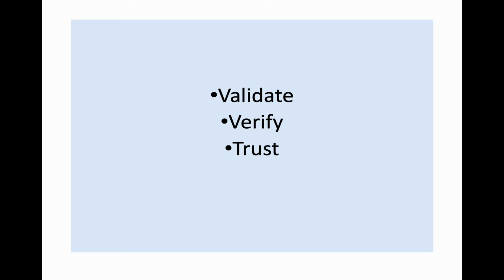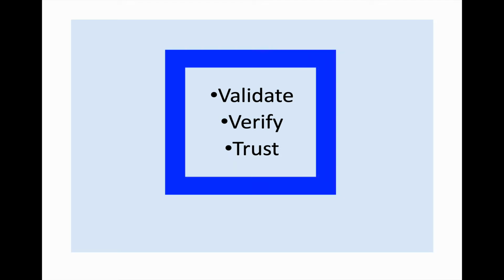In general, it validates, it verifies, and it lets you trust your data. And those are three very important things in science with regard to the integrity of your work and making sure you can stand over your data and the outcomes. Ultimately in science, you have to be able to defend your work and prove that it's correct, and you can stand over and believe and trust and validate all the results. And you need controls in order to do that.